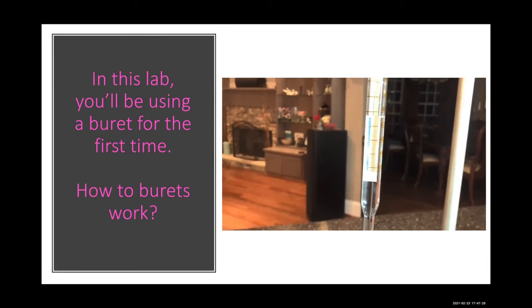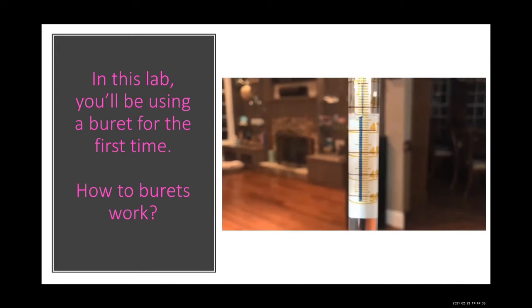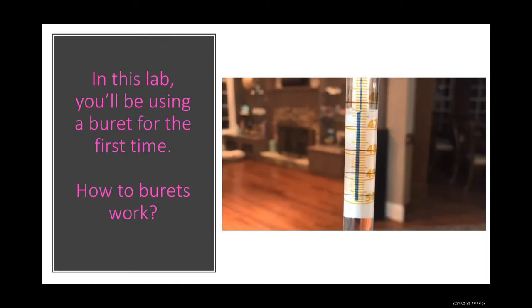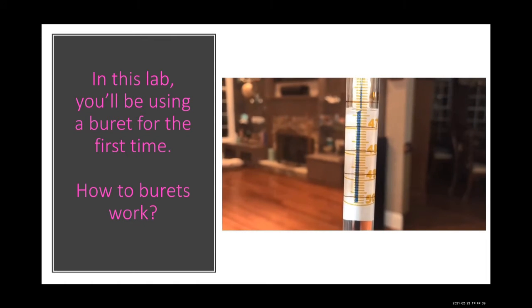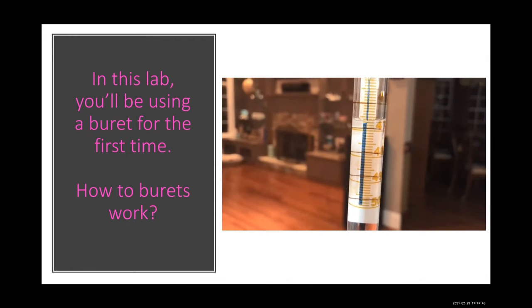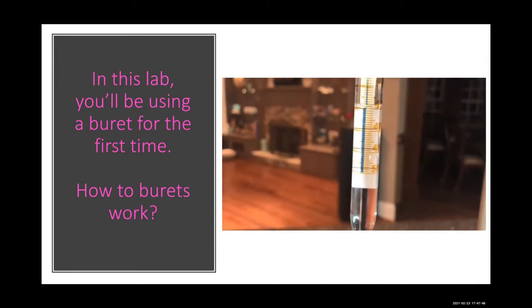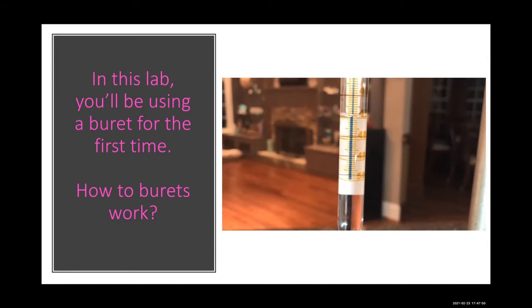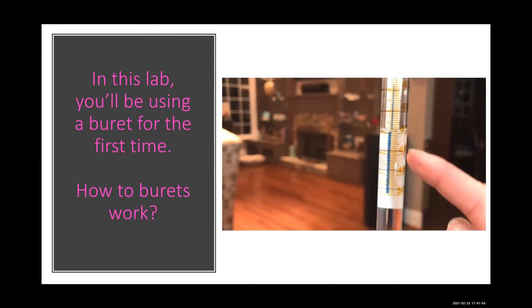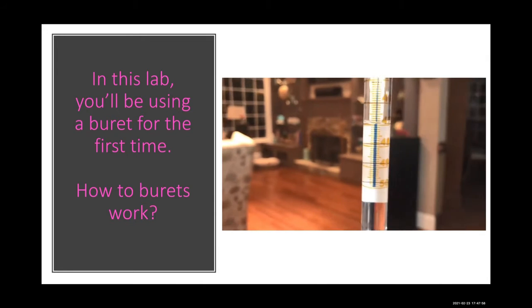So if you look right here, I don't know if you can see in this light, this burette, let's make it go right to the 47. Okay, so I'm just going to turn it, and you're always going to read from the bottom of the meniscus. So watch closely, it'll start to drip right around here. Go slow, right there. Okay, so say you want, as in this particular lab, 2 mLs. That means you have to go from the 47 to the 49. So it's a little backwards math, but it's not hard.